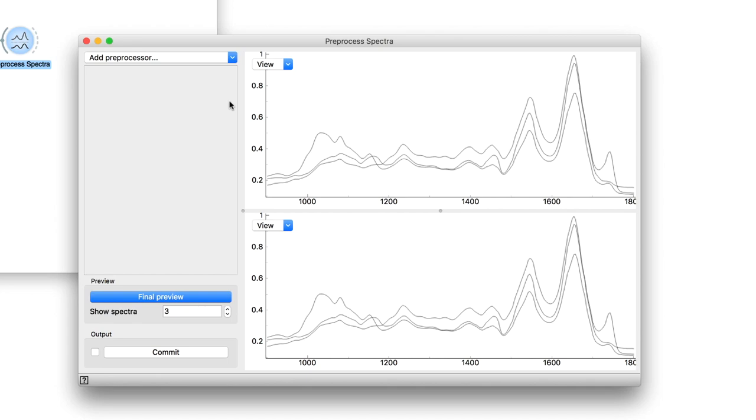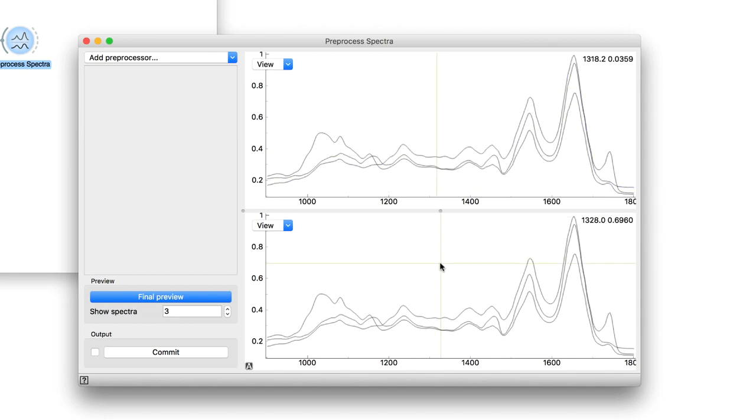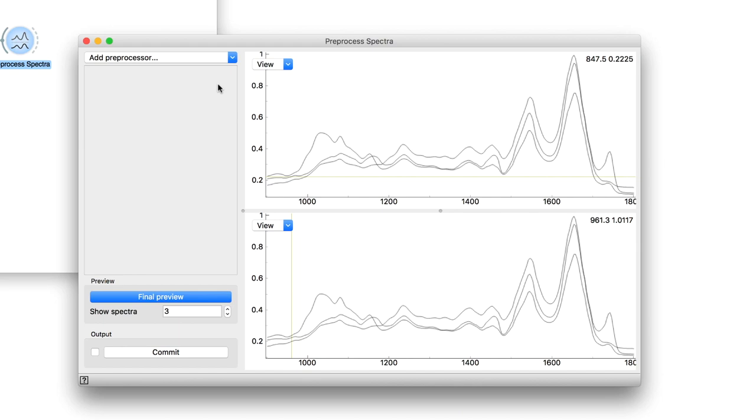On the top right panel, we see the original and in the bottom right, the final preprocessed data. At this point, they are the same as we haven't added any preprocessors.